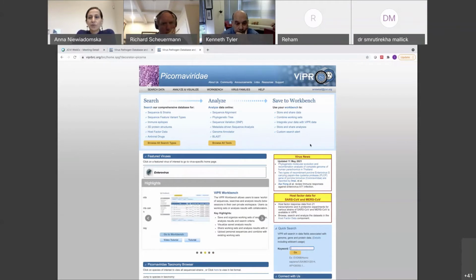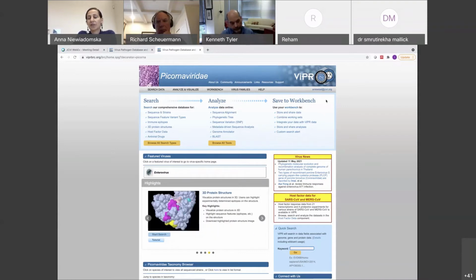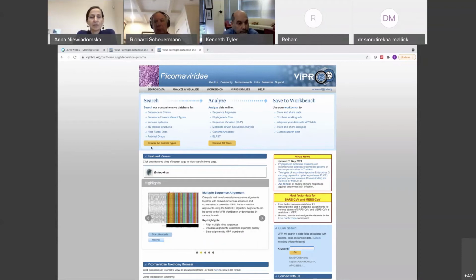You don't need to have an account to use the website, but if you do want to save your data for more than 24 hours, you should register so that you can save it there. And of course, the same goes for uploading data. Everything that you upload is private, and we do not make any of it public.